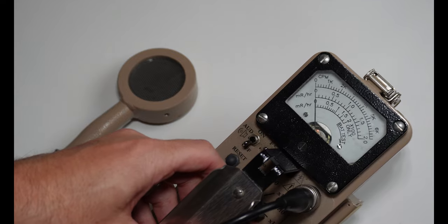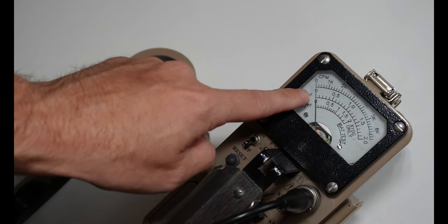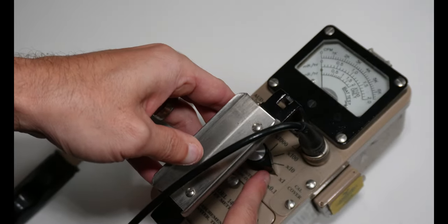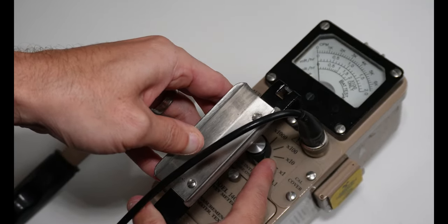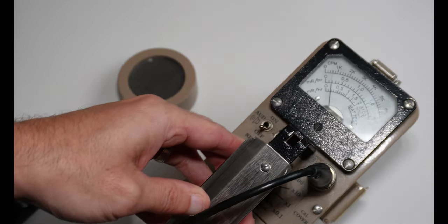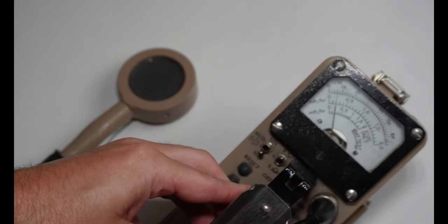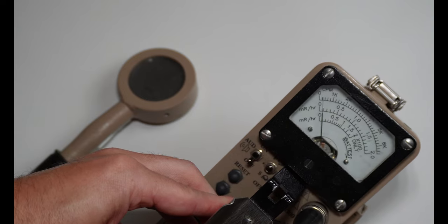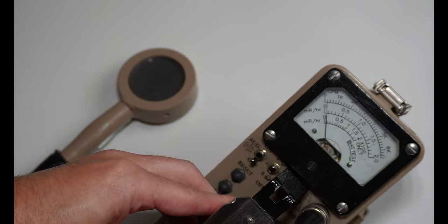So sometimes on your survey meter, you'll notice that there's no deflection of the needle at all. And that's because you would be set on too high of a scale. So if you flip it down to the lowest scale, we'll start to see needle deflection. And so there we have the needle deflecting, showing us that the survey meter is actually turned on.